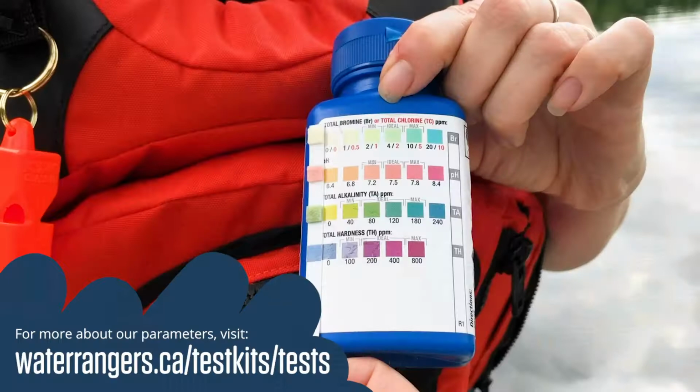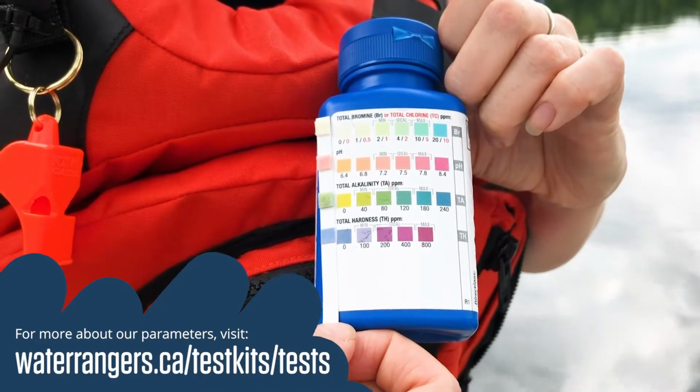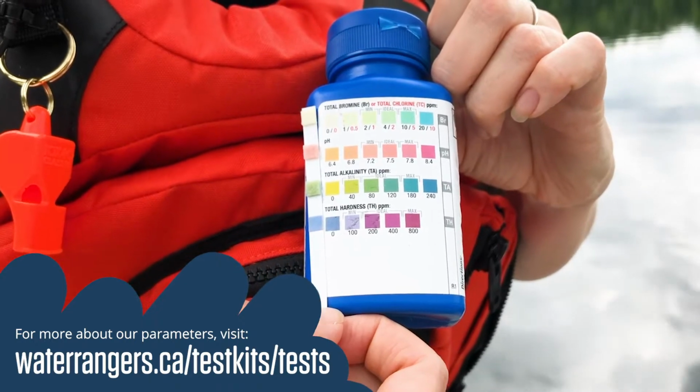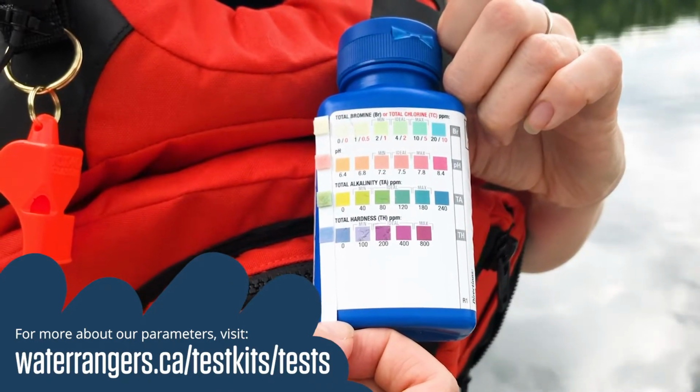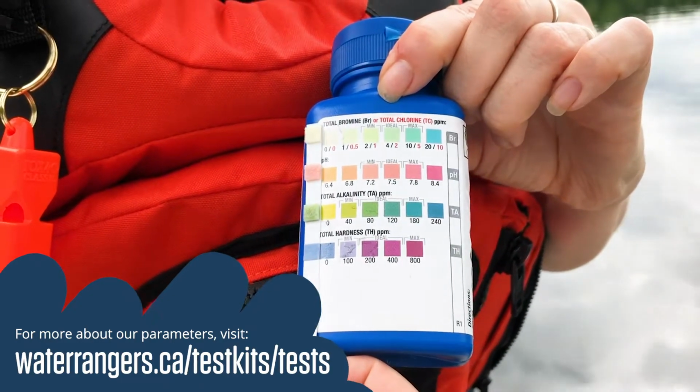And here I'm reading chlorine of 0. pH looks between 7.2 and 7.5. So I'm going to take the absolute center, 7.4. And then I'm going to do alkalinity of 80 and a hardness of 0.